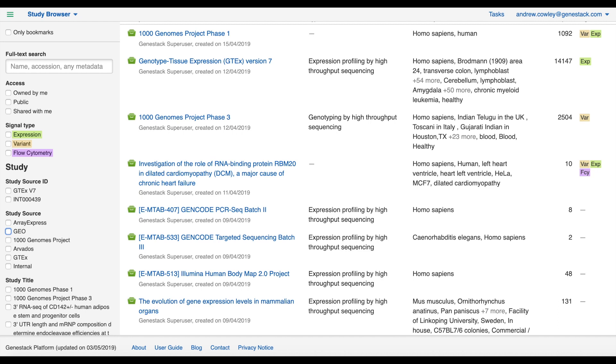When you open Omics Data Manager, or ODM for short, you'll be faced with something that looks like this: the study browser. The study browser is a study-centric portal for finding studies, samples that are part of studies, and their associated metadata and experimental or signal data.